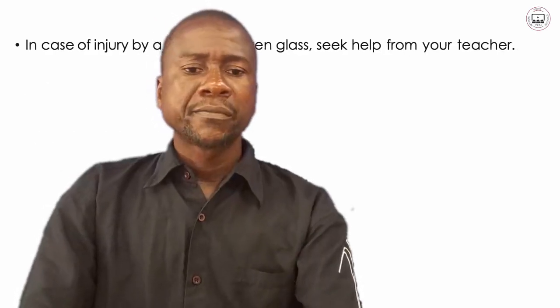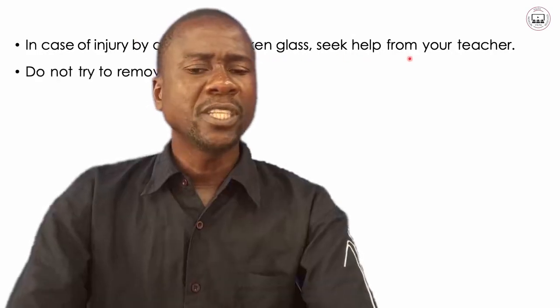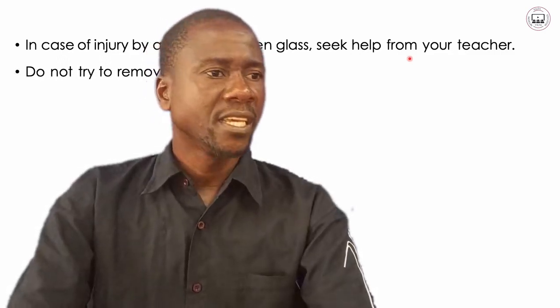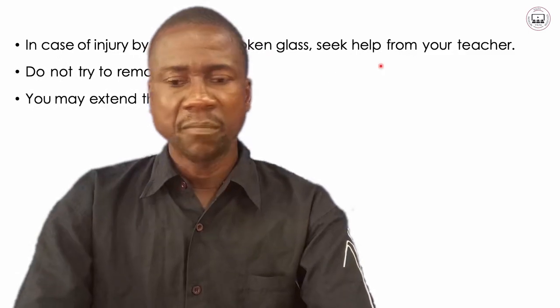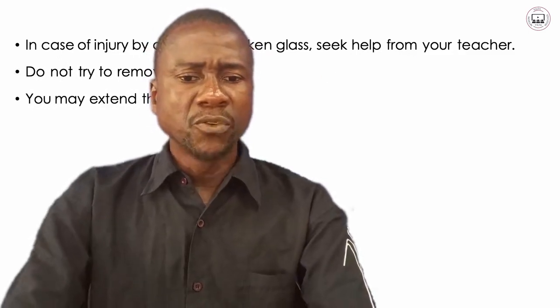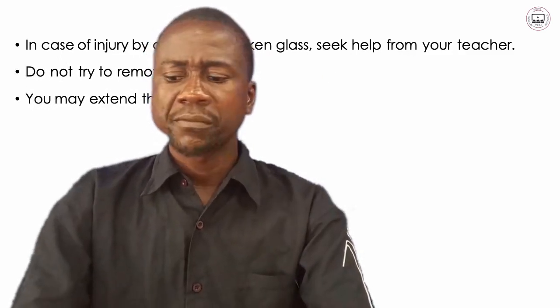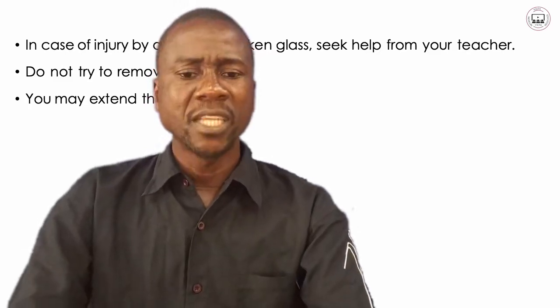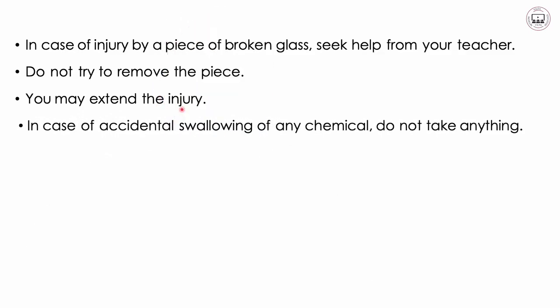Yeah, so in case of injury by a piece of broken glass, seek help from your teacher. Do not try to remove the piece. Why? Because you may extend the injury. So the piece should remain there until specialists remove it.